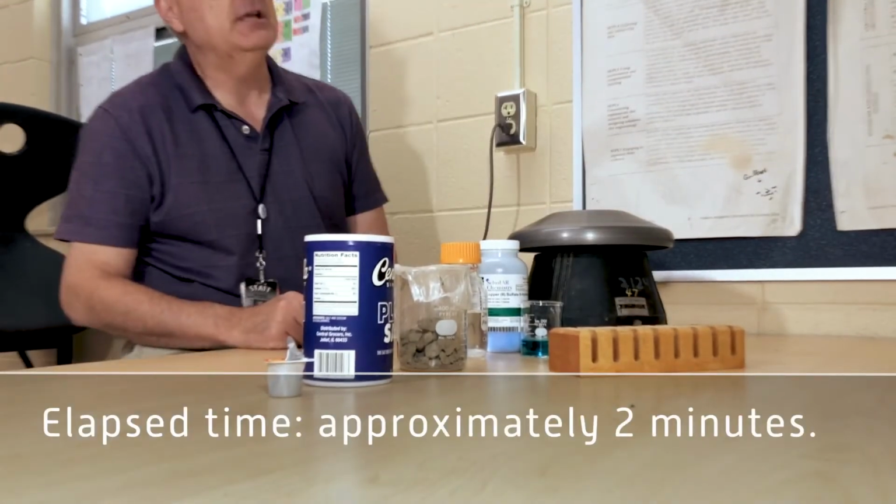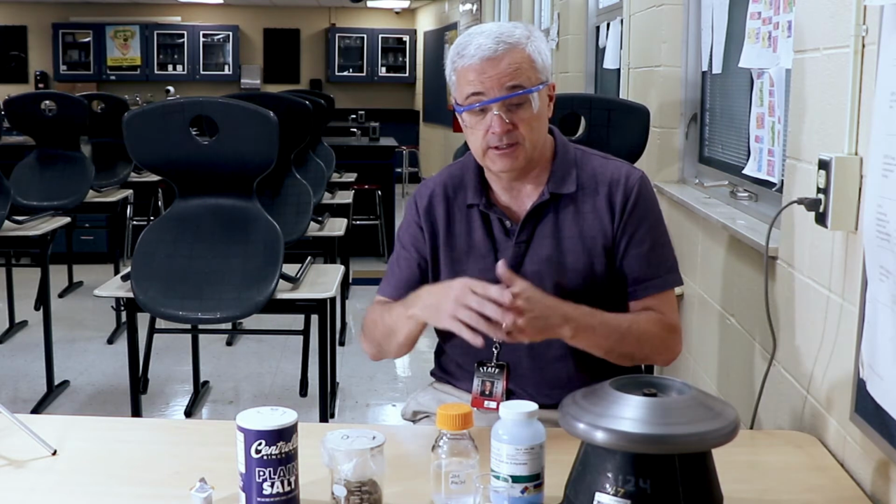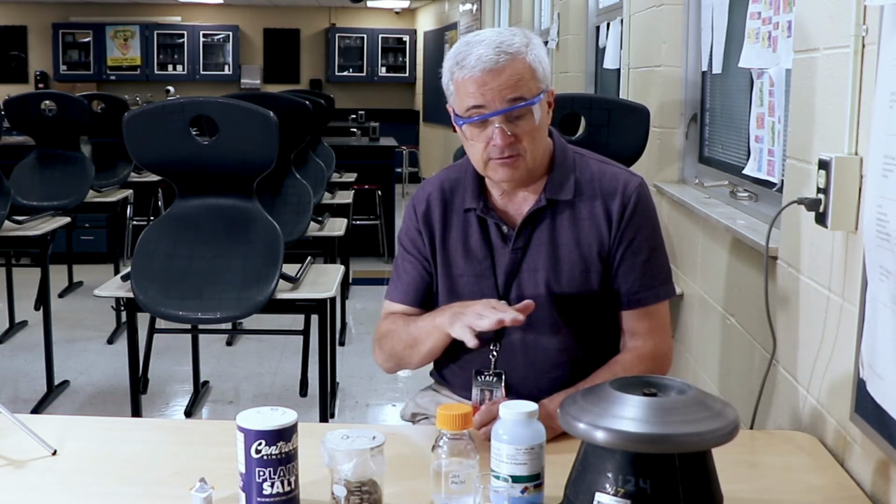probably done. The effect of the centrifuge is that the greater the difference in the density of the particles, the faster the centrifuge will separate them. Also, after you turn it off, leave it alone. Don't be sticking your fingers in there, because fingers are useful. So leave it alone. Let it spin down on its own. Be very safe when you're doing lab work.